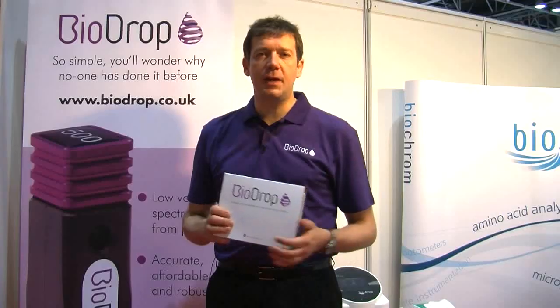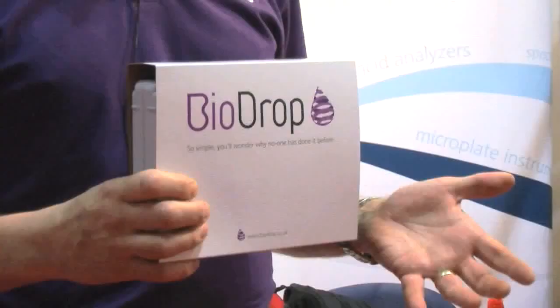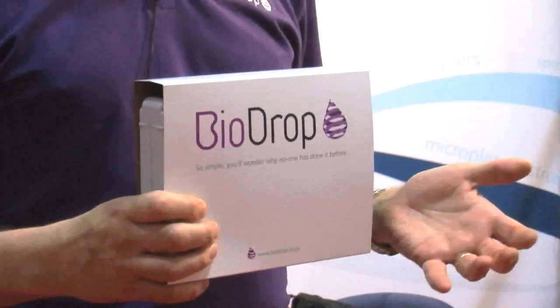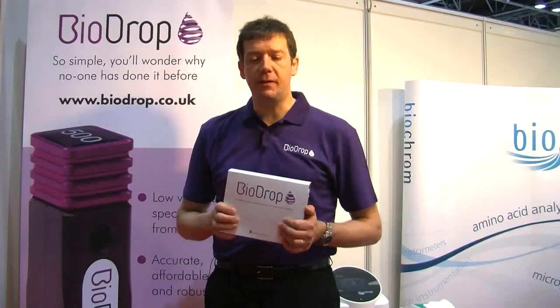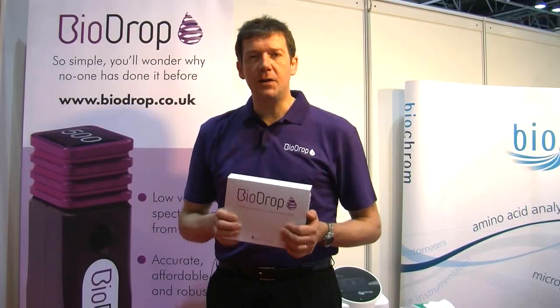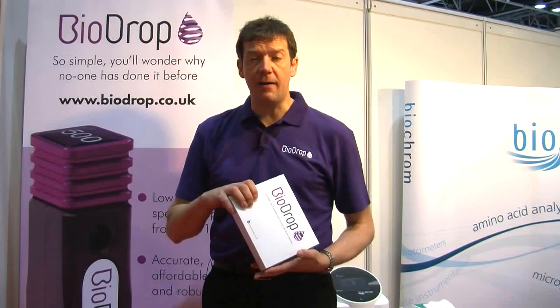On the market today there are a number of different solutions including dedicated solutions like NanoDrop and NanoView, as well as some cuvette-based approaches like the Helmer Tracell and a lot of the quartz devices. They all have their different advantages and disadvantages, and our hope is that with the BioDrop we're going to overcome some of those disadvantages those current systems have.